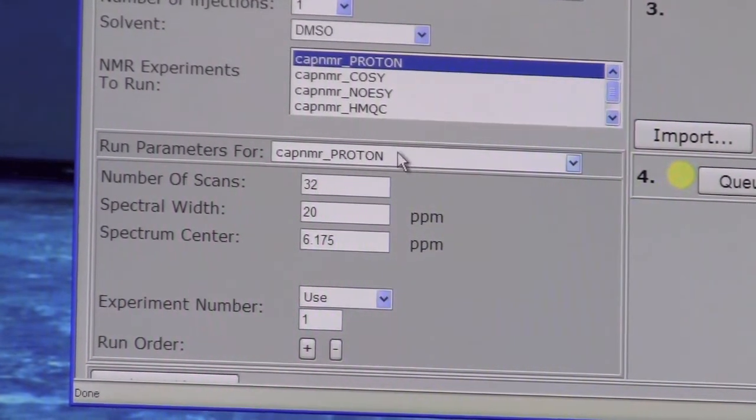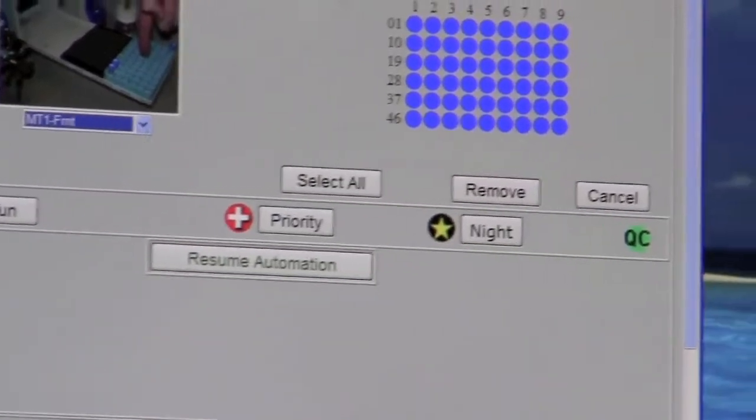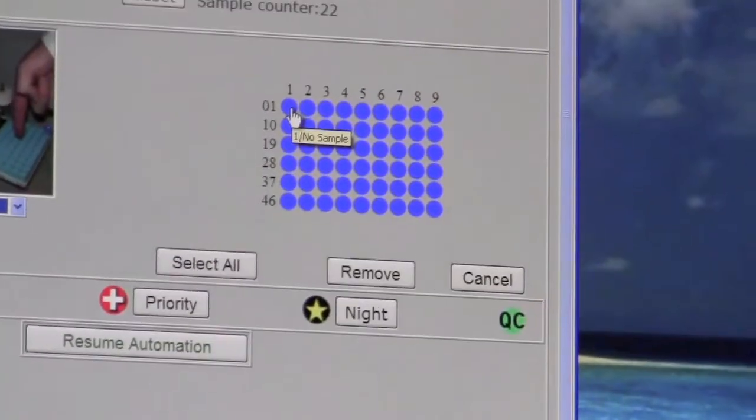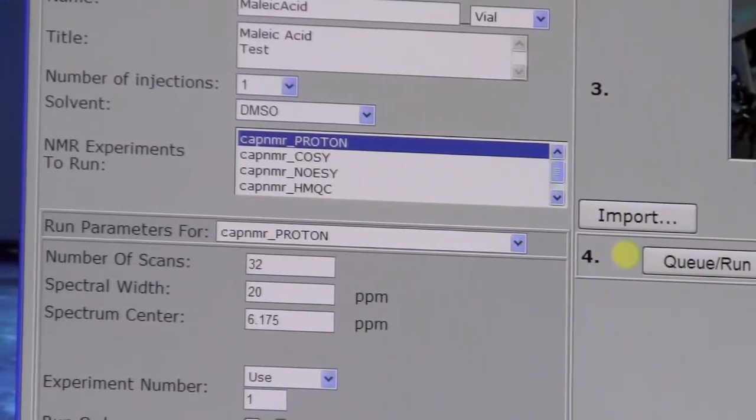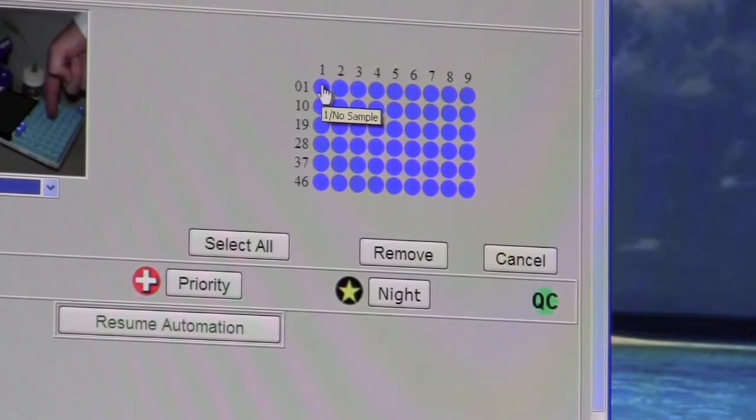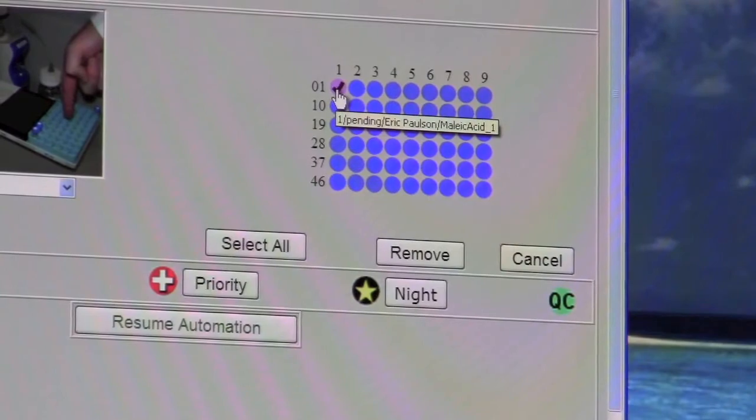Once you have everything set the way you want here, come over to step three. Make sure the tray is chosen, matching where you loaded your sample. And then click on the dot for where your sample is. This is sample number one, all the way down to sample number 54. When you click on this, everything over here gets loaded into the system. So make sure everything in step two is finished before you click on step three. So we're going to click number one, because our sample is in number one. And there will be a check mark on number one. That means it's ready to go.